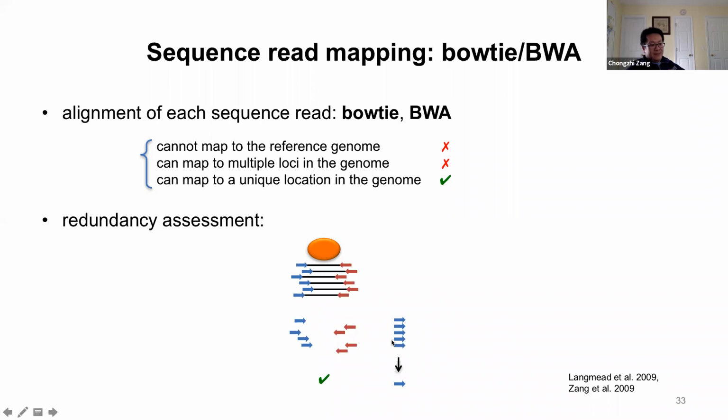But in this case, there could be a lot of reads mapped to the same position. Most likely these are due to over-amplification in the PCR or library preparation step, and do not represent real information. This can be addressed in more detail by statistical modeling to see how likely it is for two reads to map to the exact same location.